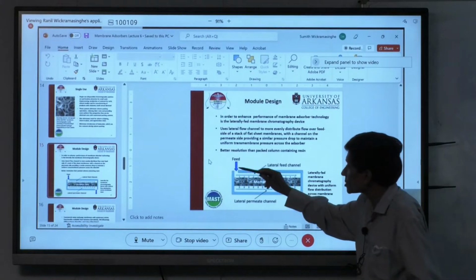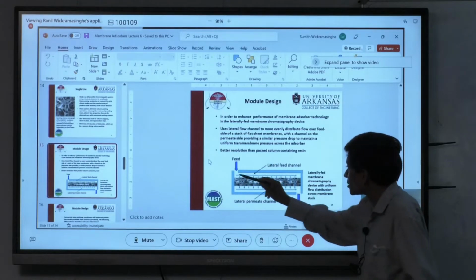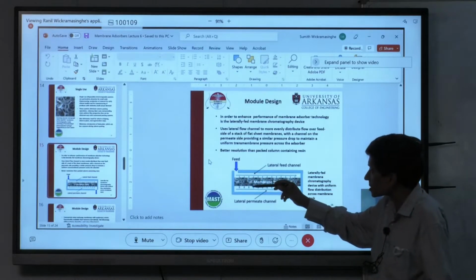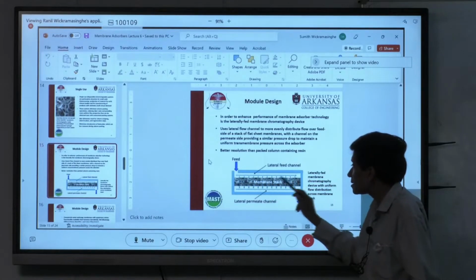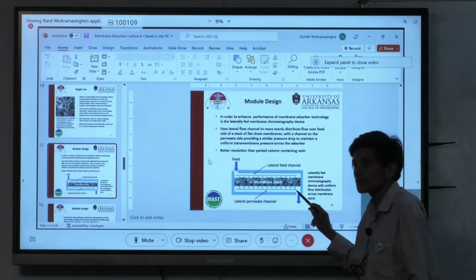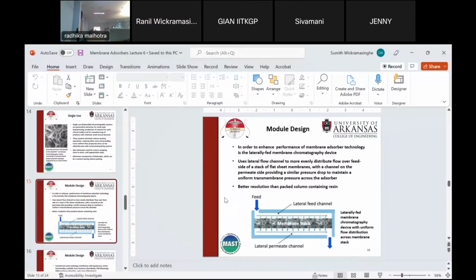Okay, but the pressure drop, what you want to do is have the pressure drop for that path to be the same as any one of these other paths. So the idea is that if the pressure drop across the membrane is the same, wherever it is, then these are always going to be the same because the lateral distance it has to go is the same, whether it's from the top or from the bottom. What if it shouldn't slide, it's slanted? Yeah, then it shouldn't slant. Yes, I agree with you. So it has to be designed very carefully.